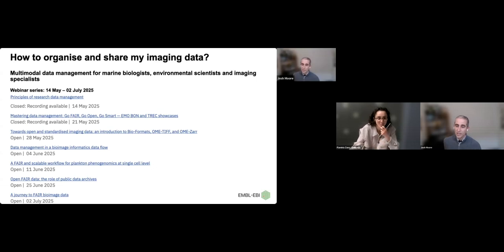Yeah, they're both great questions. And I think the short answer is we're not there yet. What it's going to take to get there will be a representation and probably an agreement from the companies that they can export their metadata in an open format completely. So what we very much would like to achieve is the statement, anything that the original file format doesn't export to us doesn't exist for the user. And so that's going to take some more time.